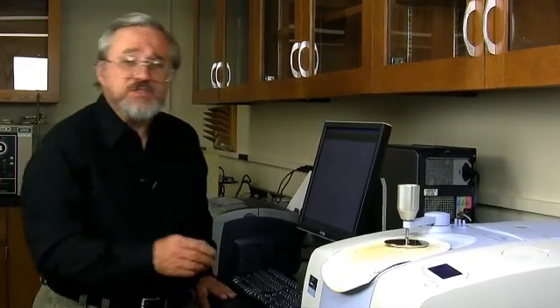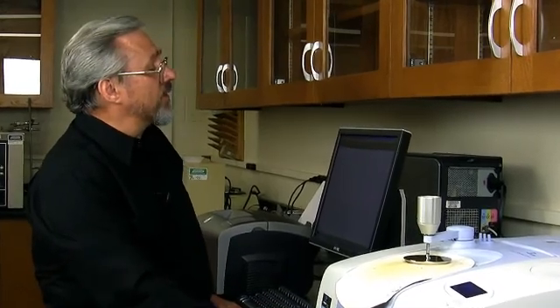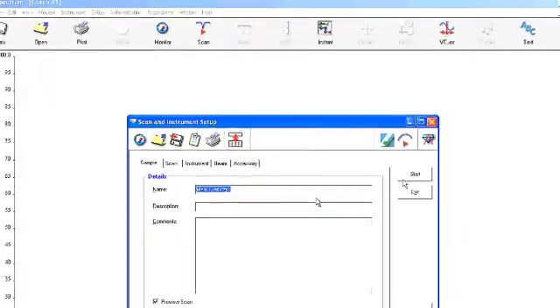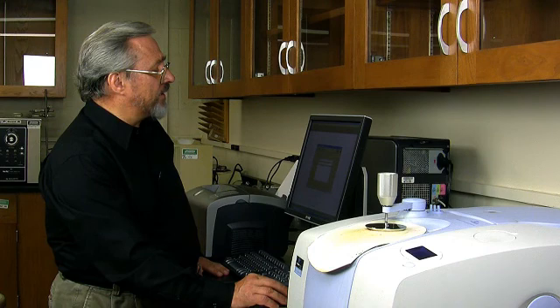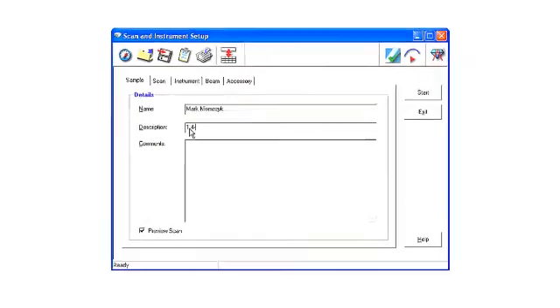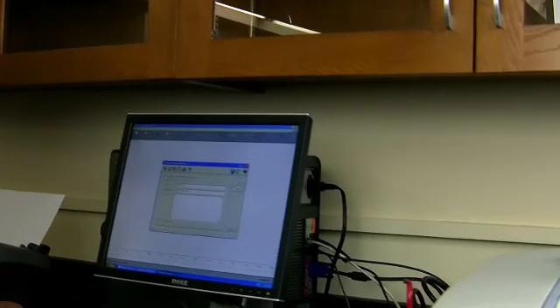The next several steps are really very easy. We're going to go back to the icon that we call Scan. Click on that. I've already entered my name in here, and I'm going to type in a description of the sample. In this case, it's 1,4-dit-butylbenzene.